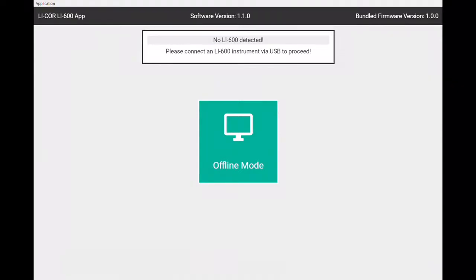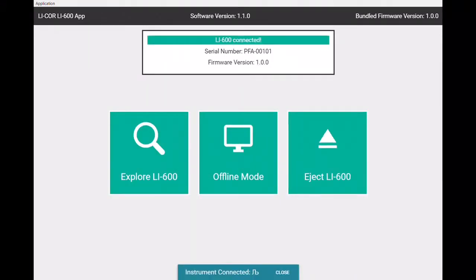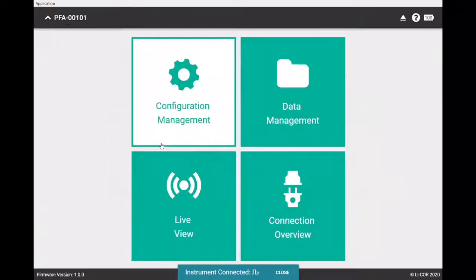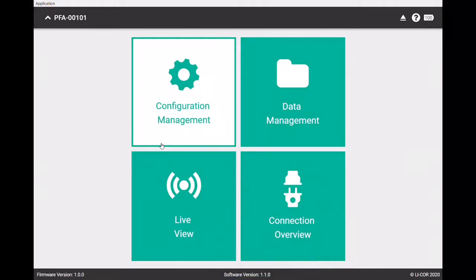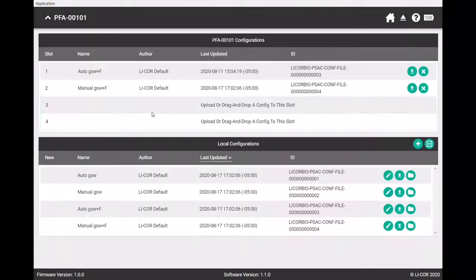Okay, so we'll start by turning our instrument on. Then we will go to the Explore LI 600, then we'll select the configuration management.